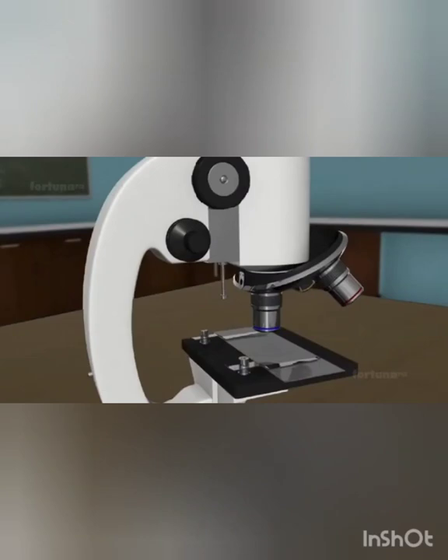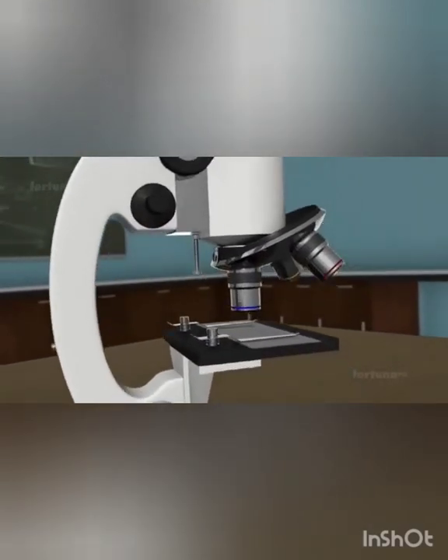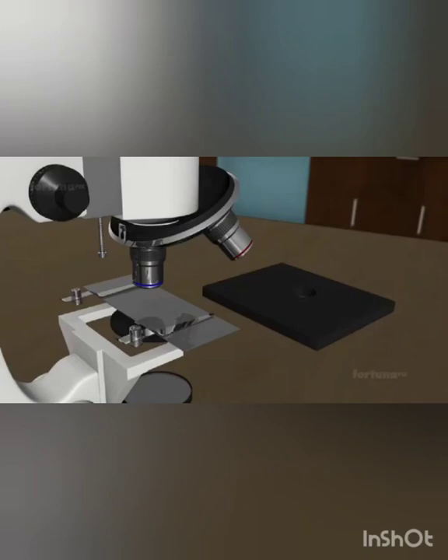Then, as you can see, there is a revolving nose piece, which is also known as a turret. This is the revolving nose piece attached to the lower end of the body tube. It can be rotated to change the magnification as necessary.